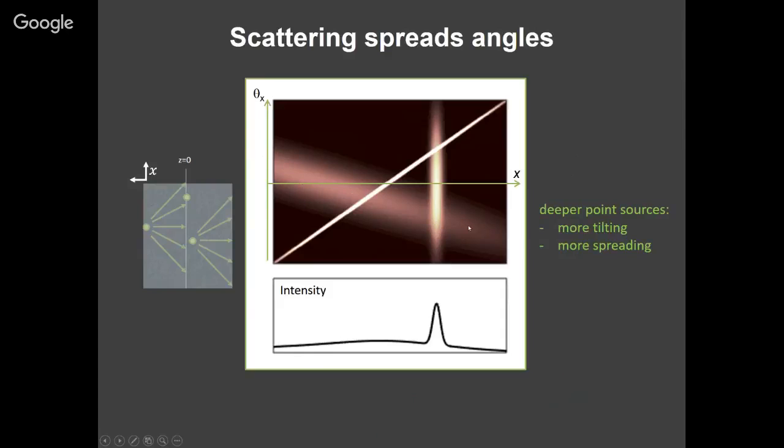In fact, we have this fancy multiple scattering model with Wigner functions that fully accounts for wave optics. And what you end up with is basically the lines blur into 2D Gaussian blobs of particular width, depending on the scattering functions. And the cool part is that now the depth of the object is not just different amounts of tilt of these lines, but also how much the lines are blurred out in this 4-dimensional phase space.